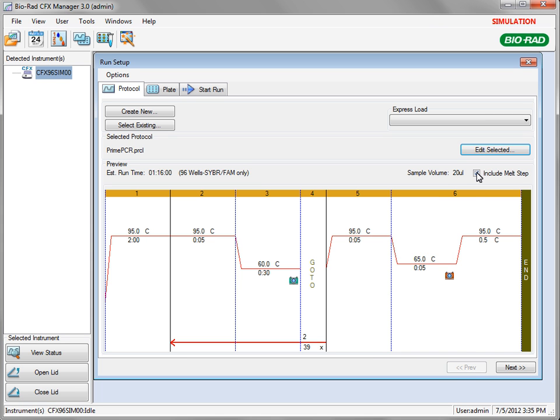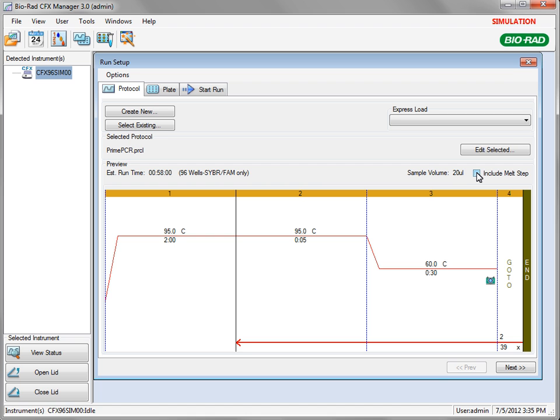By default, a melt step is inserted at the end of the amplification step so that when a run is complete, the presence of non-specific reaction products can be monitored. While not recommended, you can remove this step by unchecking the Include Melt Step box. This will reduce the total run time.